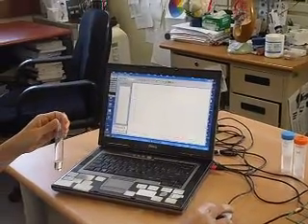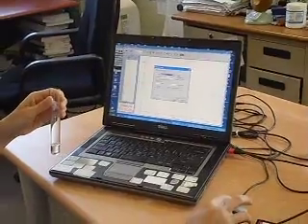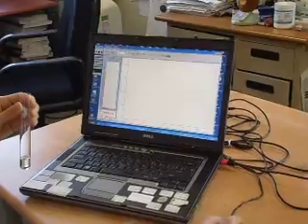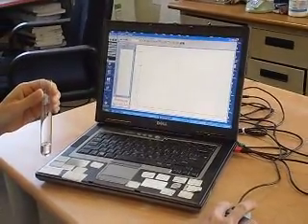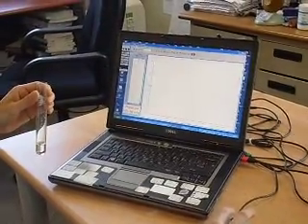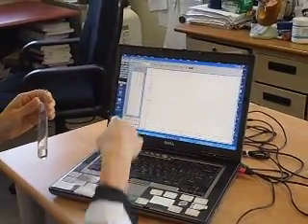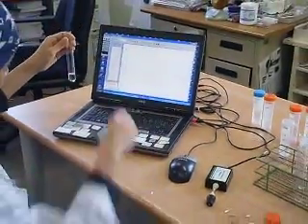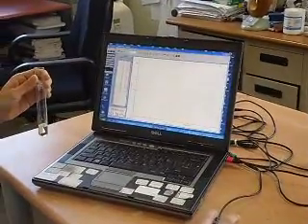The first thing now, get into data collection and make sure it's time based. Set it to 900 seconds. Click on OK. So you'll get pressure against time for at least 900 seconds. I'm going to click on the collect button. So start data collection first. Currently the baseline, which is atmospheric pressure, is 101.36 kilopascal before I add the magnesium strip, before the reaction starts. So the base is this, atmospheric pressure before the reaction.